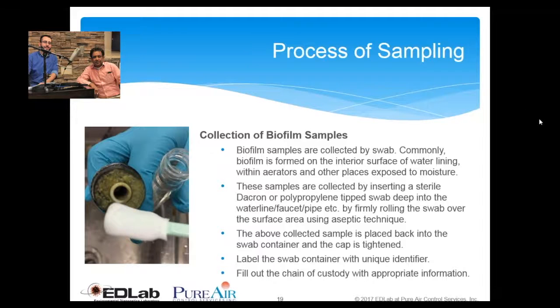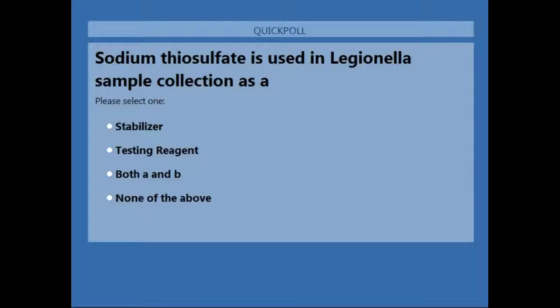Okay. With that, we're going to go ahead and ask our fourth question. Sodium thiosulfate is used in Legionella sample collection as a what? The options are stabilizer, testing reagent, both A and B, or none of the above. Give everyone about 20 seconds.